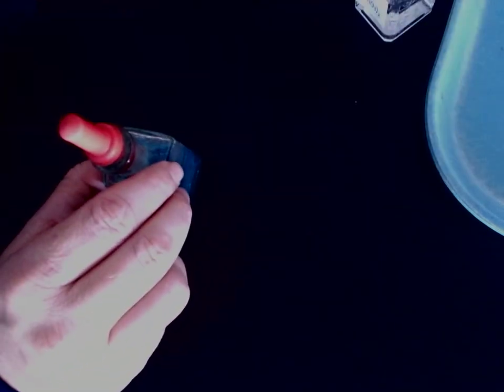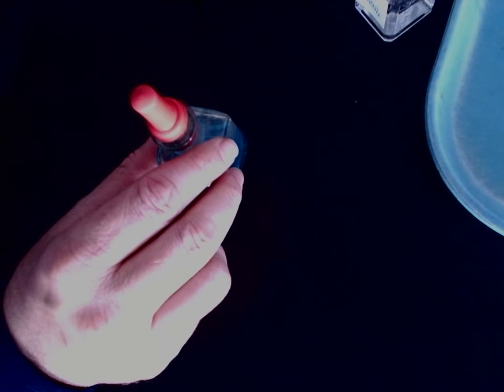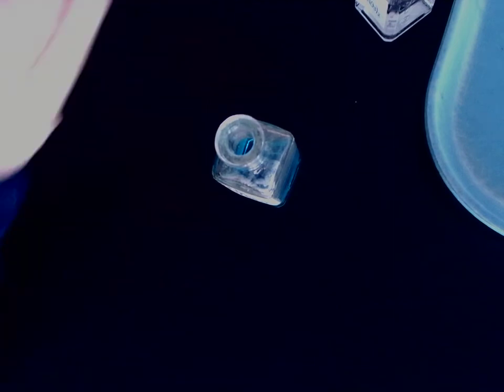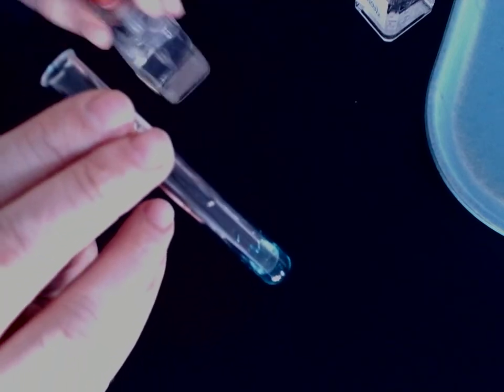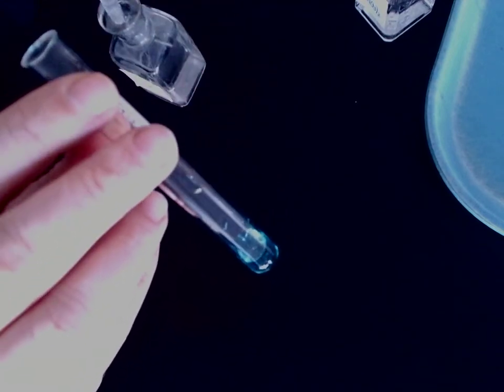The next row we're going to be working with is copper nitrate. The first one is going to be copper nitrate with sodium phosphate. There's the copper nitrate, and here comes the sodium phosphate.